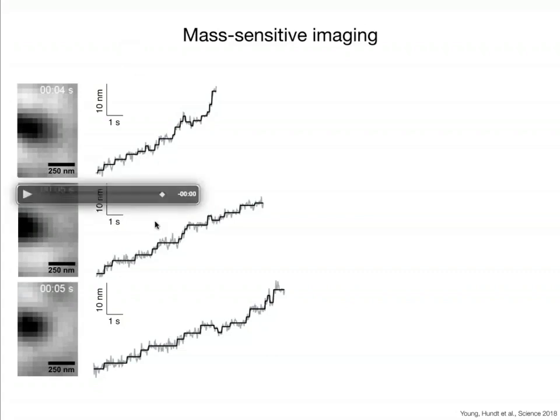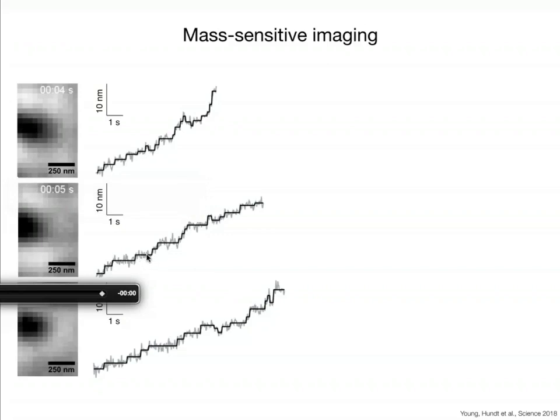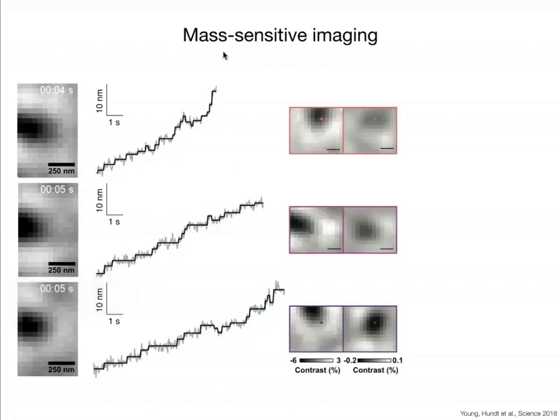And if I would now take the frames that correspond to such a plateau and subtract the frames that correspond to the previous plateau, I would get a difference image that gives me a scattering signature of whatever protein species attaches during that time point.